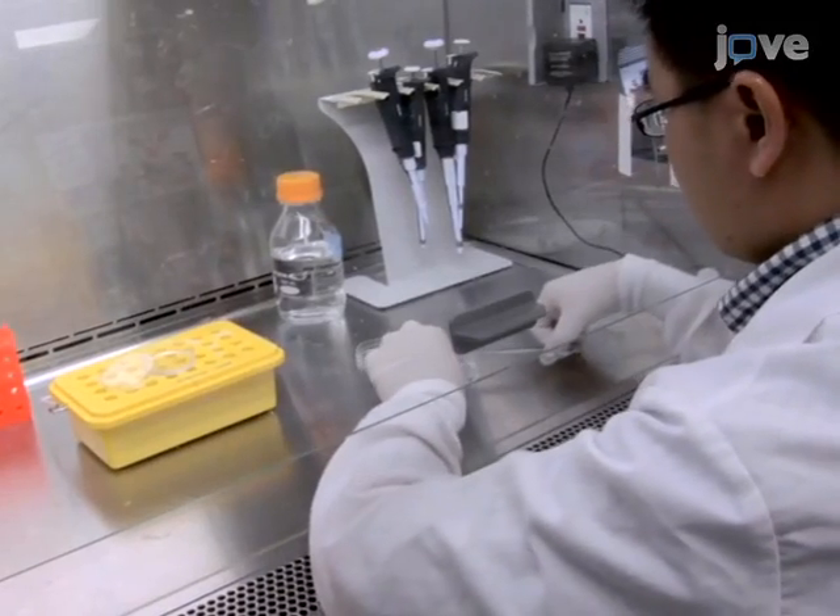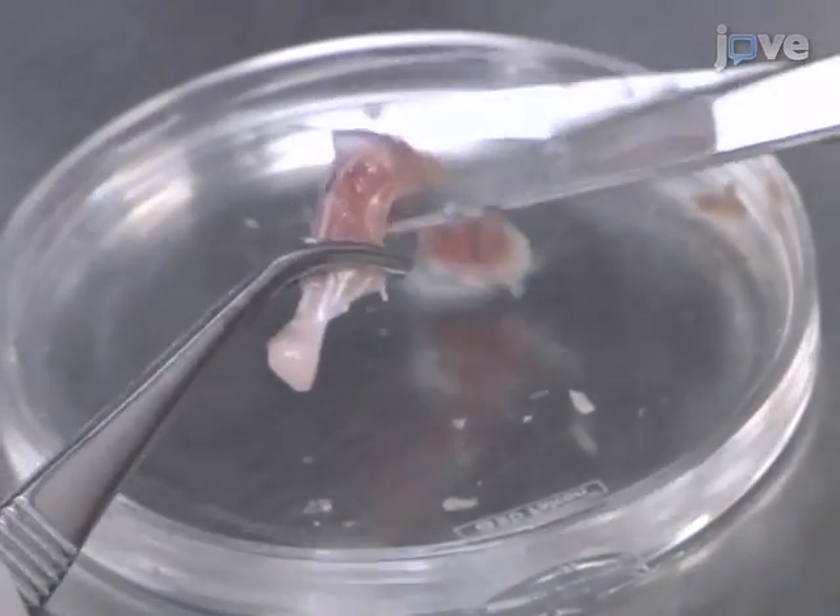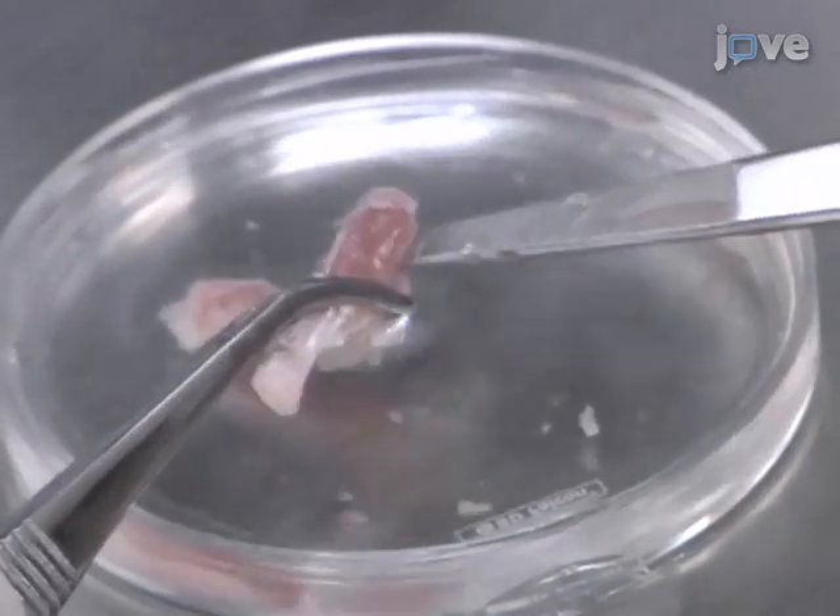Working in a sterile hood, begin this protocol with femur and tibia bones isolated from six to eight week old mice. In a tissue culture dish, rinse the bones in PBS. Then use scissors to cut open both ends of the bones, taking care not to remove too much.